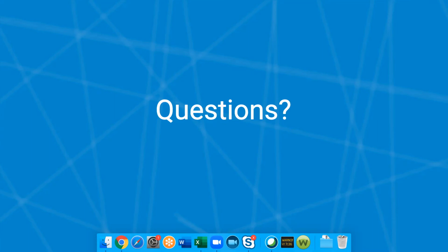So another question that we got is, when you define workflow job templates, does each job depend on the completion of the previous job? Or can you have multiple jobs start independently or configure which job is dependent on another job in the template? So I'll answer these in a few different answers here. The first one, whether or not each job is dependent on the completion of the previous job, is a feature that we would like to implement for 2020 as essentially connected workflow jobs.